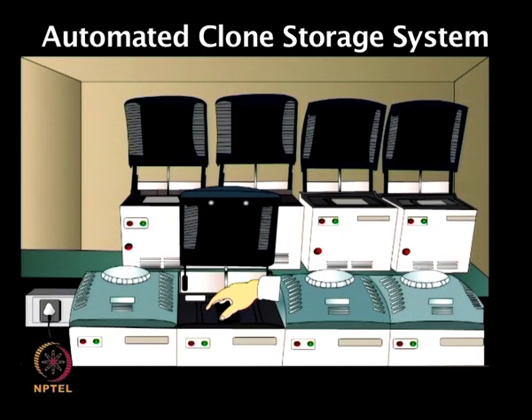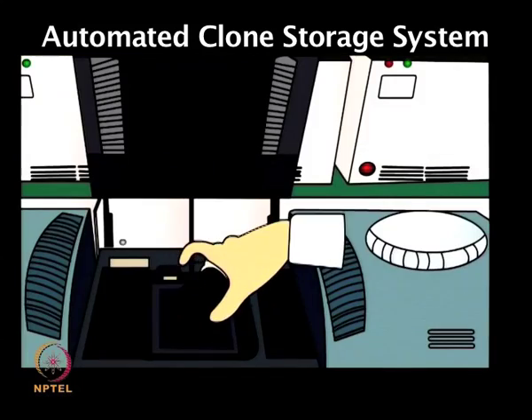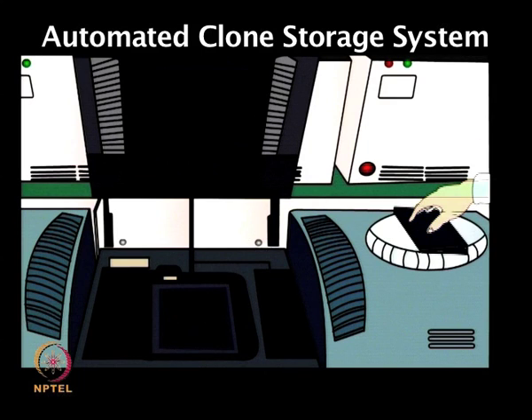This process is highly efficient and enables the transfer of many genes simultaneously into different expression vectors in a single step, in frame and without mutations. By using the recombinational cloning approach, the coding sequences can be transferred into any expression vector in a simple overnight reaction.